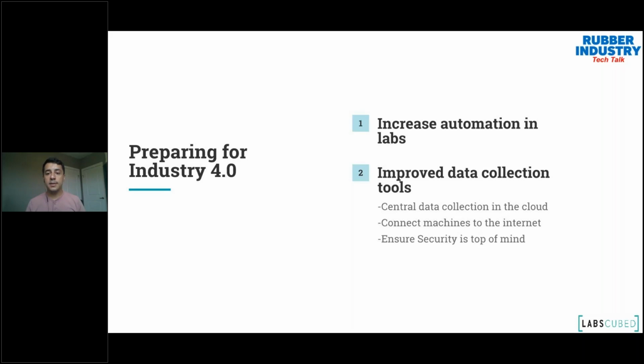The second thing is improving your data collection. We see pretty sporadic data collection, where each system might save into a place. There's still Excel sheets where people are doing very interesting things. There's still papers where people write things on them and then they scan them in. You've got to improve all those and really try to digitize and clean up that process as much as possible. Centralize it if possible into a cloud system.